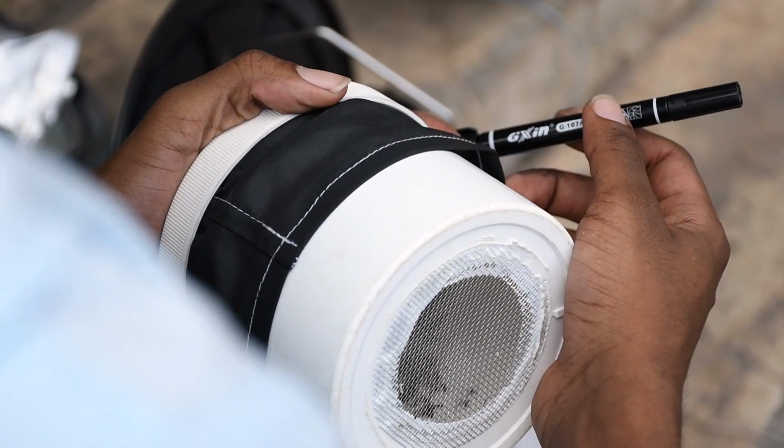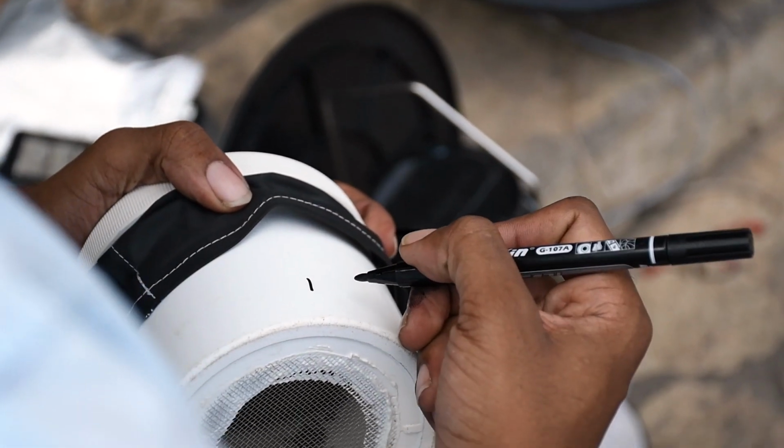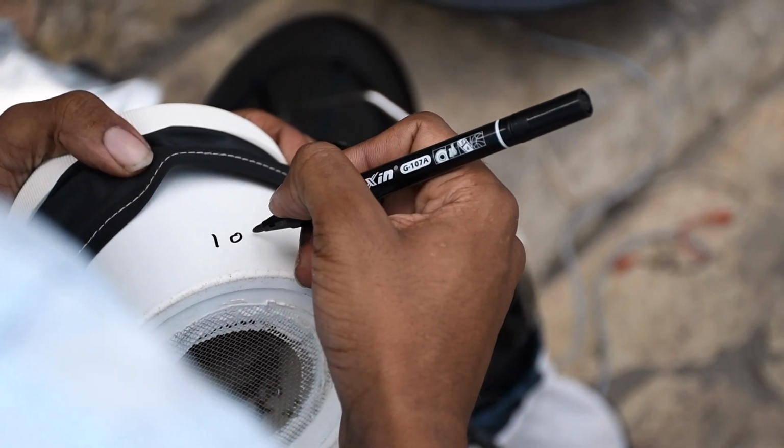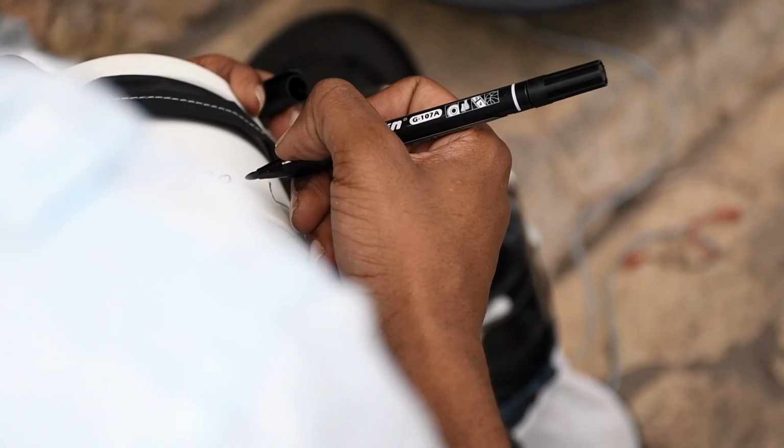Once we've retrieved the mosquitoes, we label the cup based on the location, the household number, and the sampling ground. In the current location, we use number 1, then the household number, which is 7, and we end with the sampling ground, which is 6.